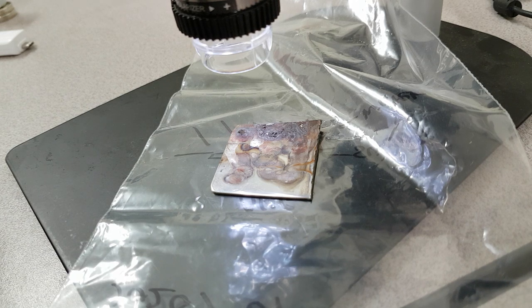Hi, my name is Bob Grunia and I'm a volunteer with the Martin Fleischmann Memorial Project. It is the 17th of July 2020 and this morning I received some samples from a show that were done with Amazagas last month.